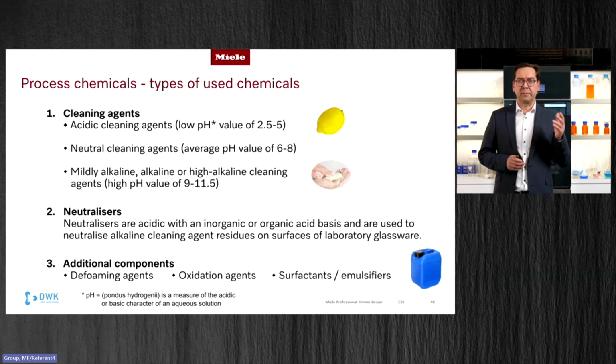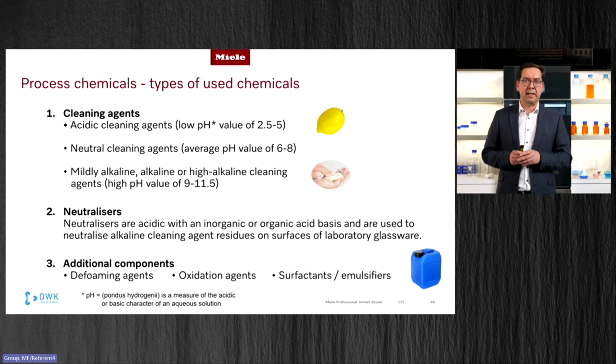For example, you would use a defoaming agent in those cases where your soiling reacts heavily with an alkaline detergent, and it creates a lot of foam in the chamber. And foam is not really beneficial to achieve very good cleaning results. So with a defoamer, you avoid foam, you have stable water pressure, and with that, you come to the required results.